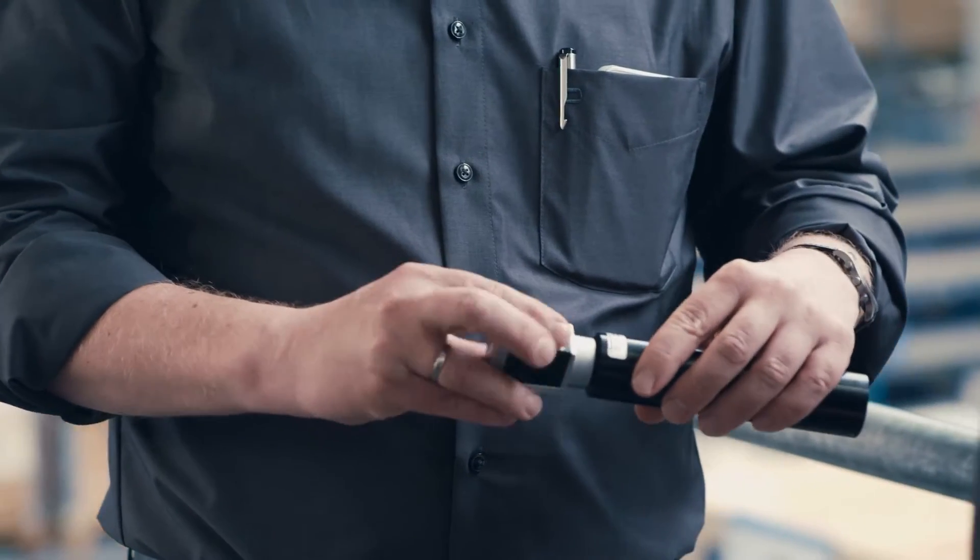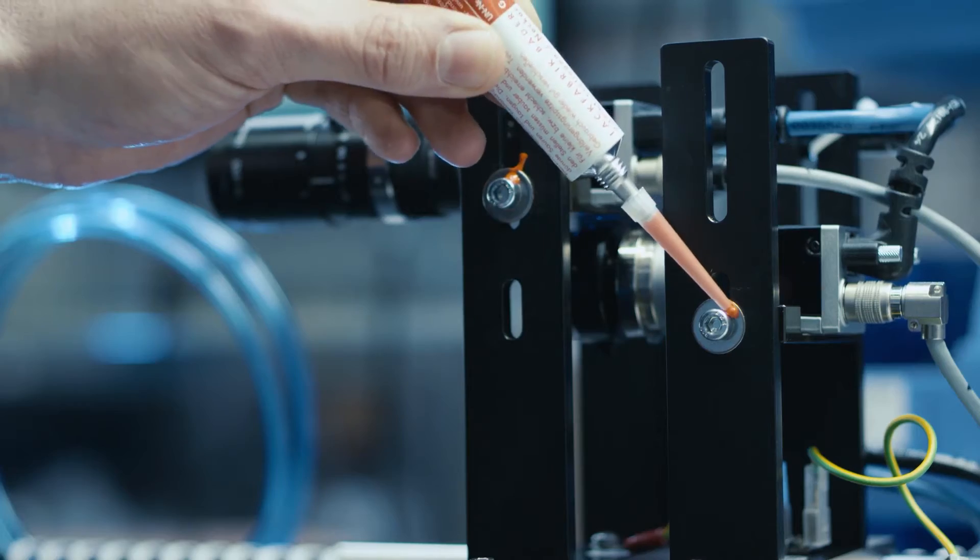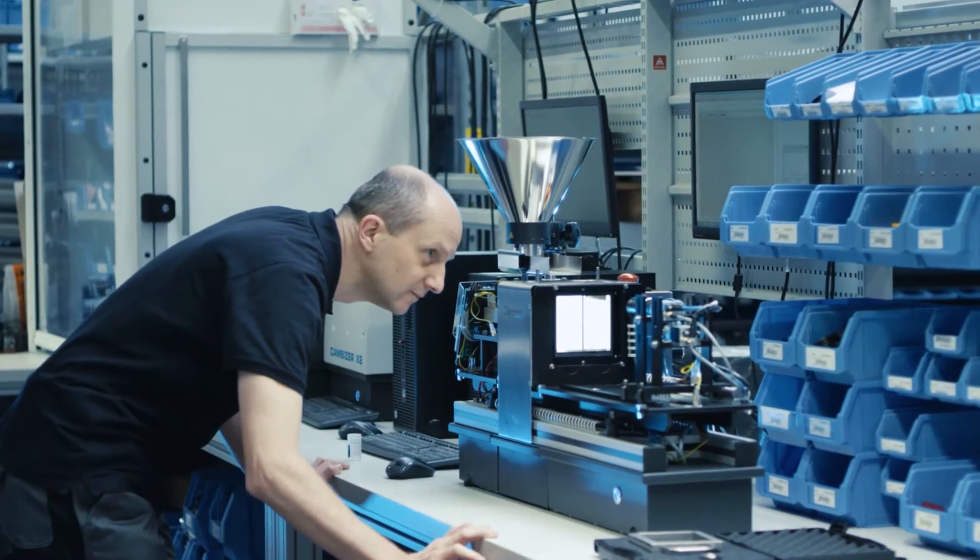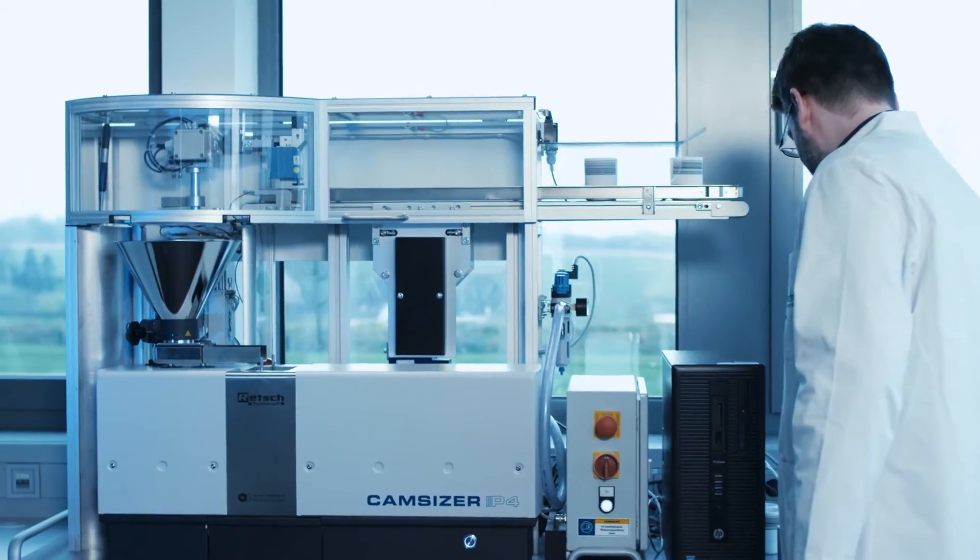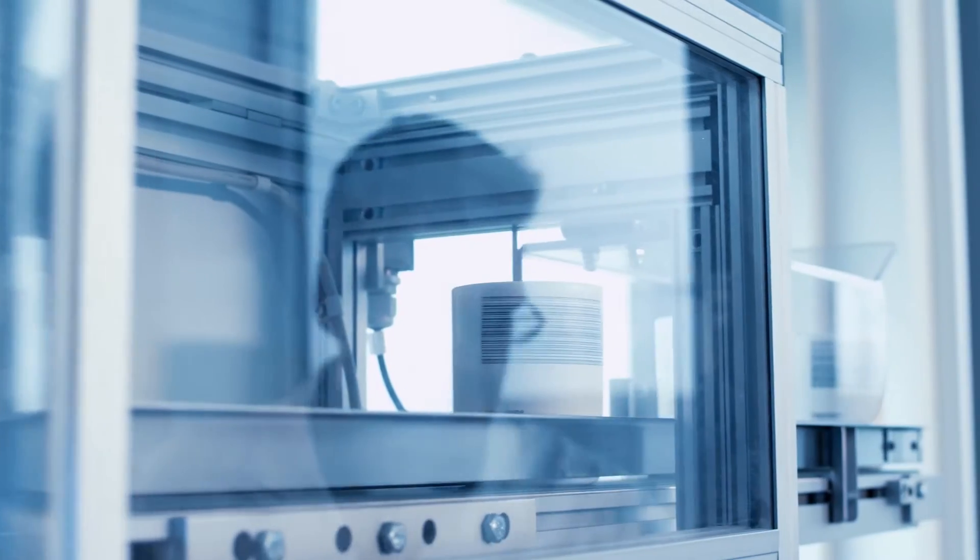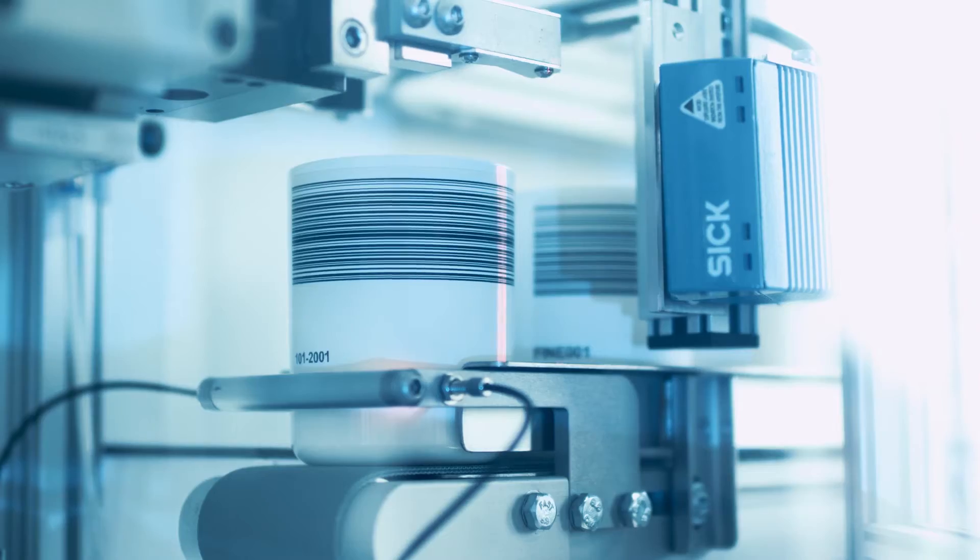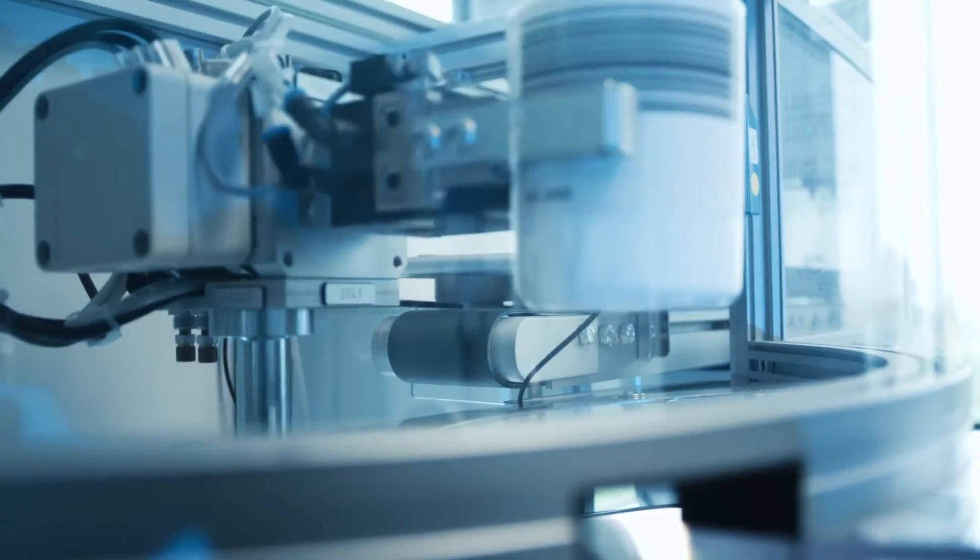One reason for this is our in-house development team. We construct precise optical instruments designed for non-contact, non-destructive, and automated particle analysis, which save time and money in laboratories all over the world.